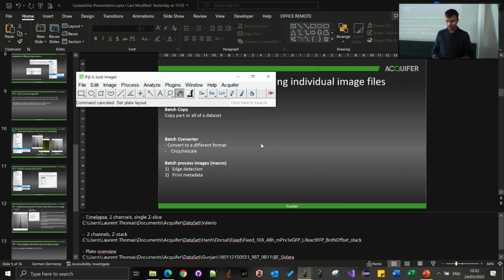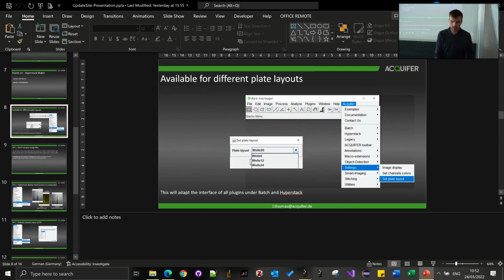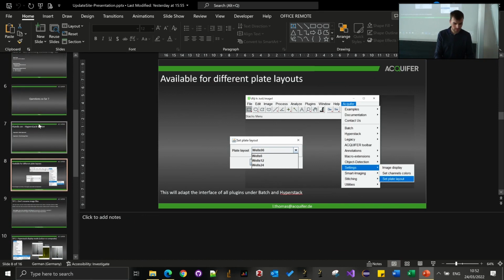So I'm pretty much done. Let me just go through the slides. Well, maybe just a small recap, because I gave some tips, so maybe you didn't get everything.